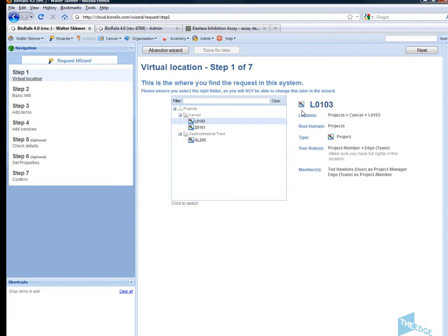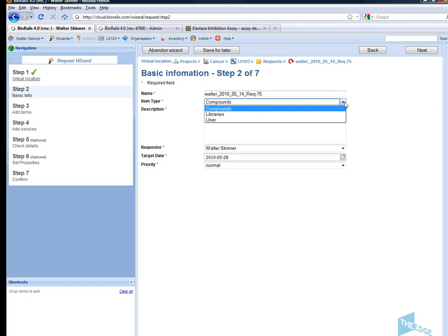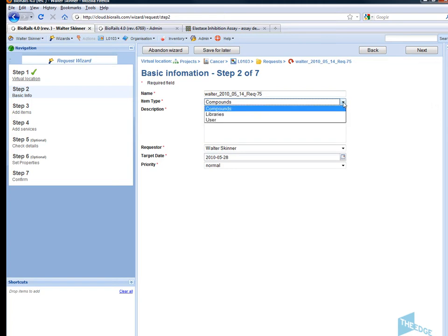I'm going to select the project I'm working on. A request ID is automatically generated by the system. I can select what sort of item I'm going to submit to my request. In this case I'm going to submit a list of compounds.